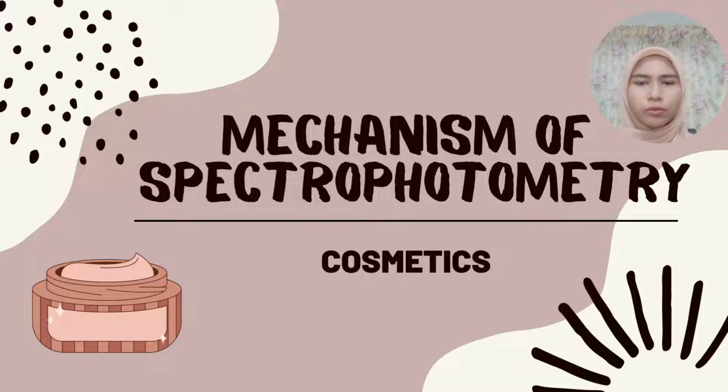So now, I will proceed to the mechanism part, or how the analysis of cosmetics is done by using spectrophotometry. But before that, it is better to let you know why it is a must to determine the toxicity in the cosmetic products.